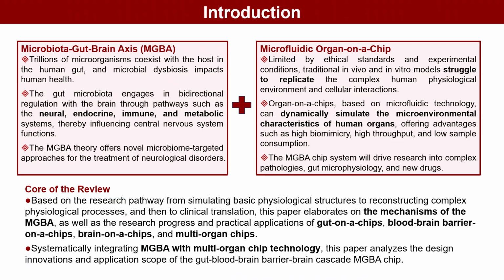Human gut microbiota is symbiotic with the host. Its dysbiosis is linked to multiple diseases. Via neural, endocrine, immune, and metabolic pathways, microbiota engages in bidirectional communication with the brain through the microbiota-gut-brain axis. Traditional research models struggle to replicate the human body's complex physiological environment.